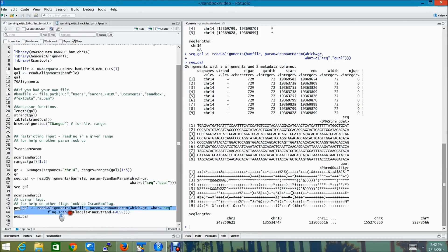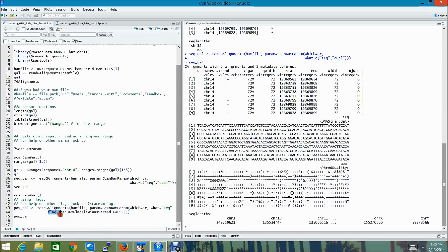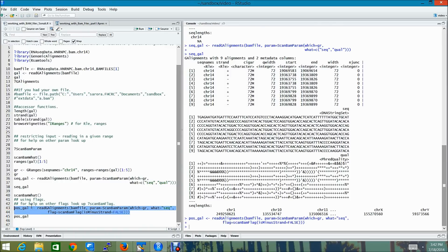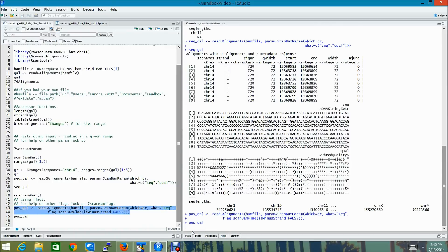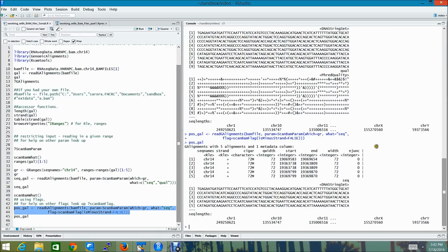Now I'm going to show you a third example about reading in data only from the positive strand. This can be done using the flag field. So I'm just going to use scanBAM flag and set the minus strand equal to false. And if you look at pos_gal, you will be able to see that the reads contained in this object are only from the positive strand.